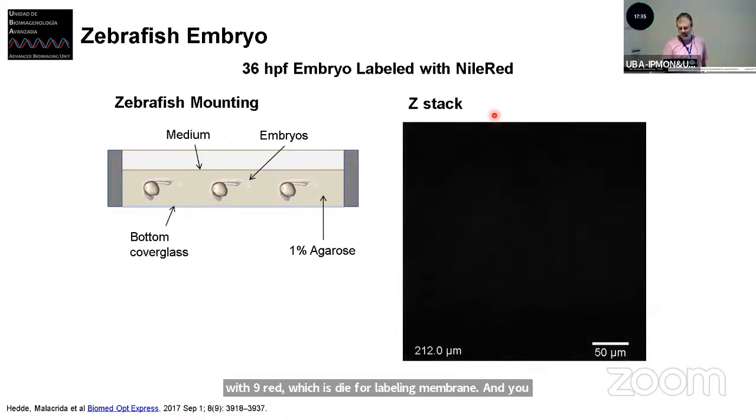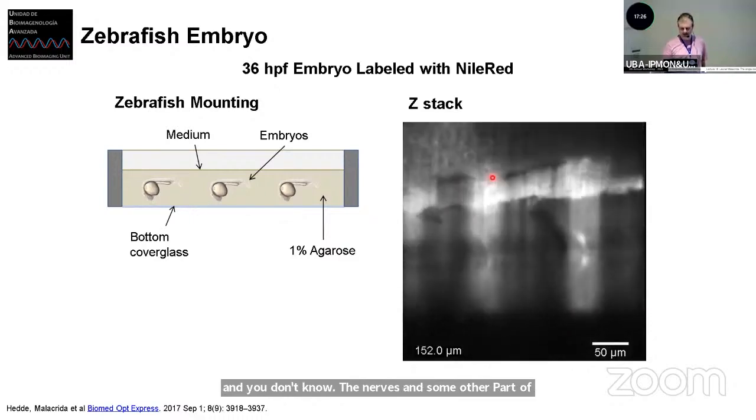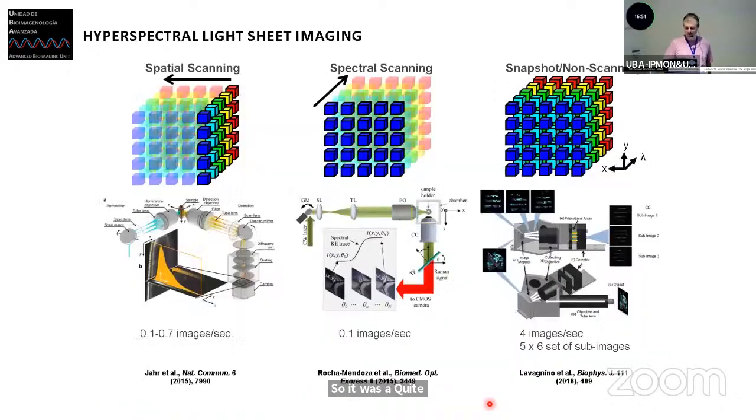And you can see many structures here, like the muscles and the nerves and some other parts of the zebrafish, the blood passing through. And we were so fast in doing this that we can see individual erythrocytes. This is a 3D view of a microcapillary in the zebrafish, where we can capture the path of the erythrocyte through the microcirculation with a 50 stack at 0.2 second time interval in the whole z stack. So it was quite a nice instrument to work with animals too.